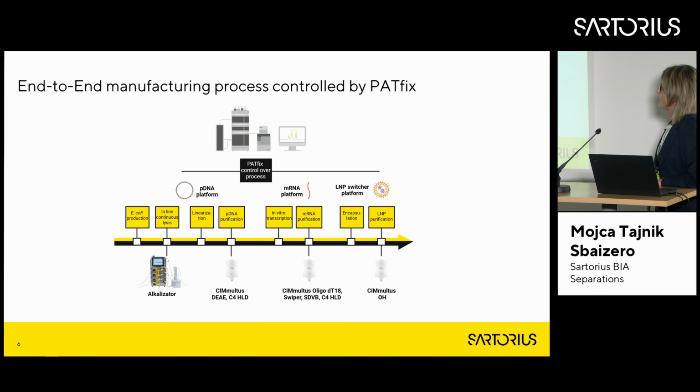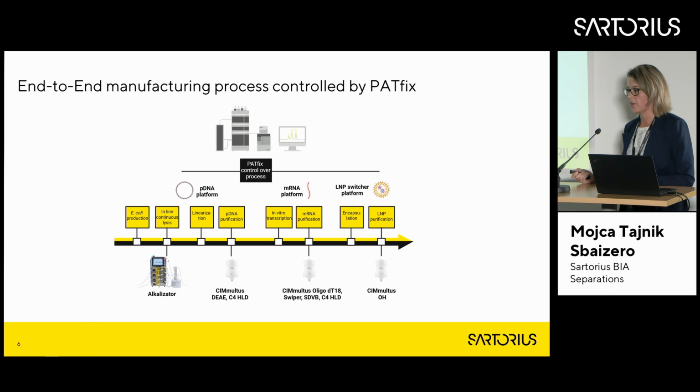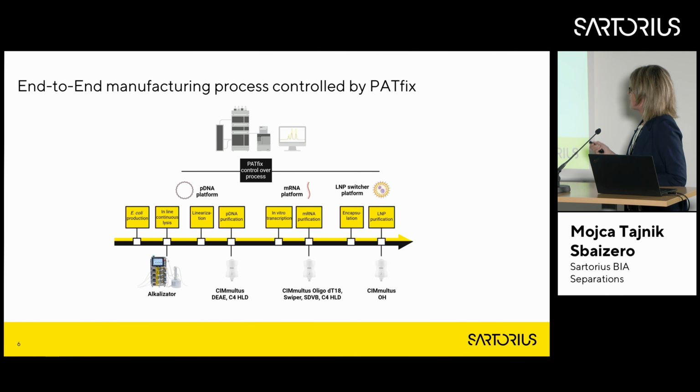LNP-based pharmaceutical purification. This part was described in the Roque talk, so pDNA and mRNA producing and purification. And then we are actually on the last part of this scheme, LNP producing by encapsulation. So encapsulating the mRNA that we heard, also the quality there is very important. And then the purification of the LNP.